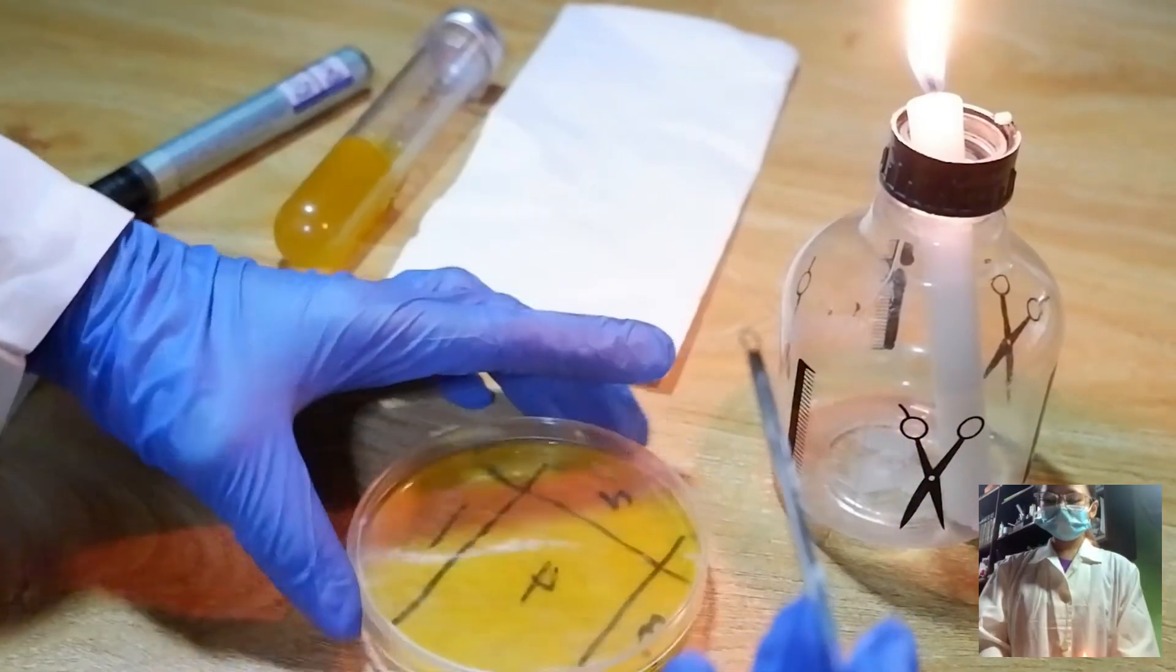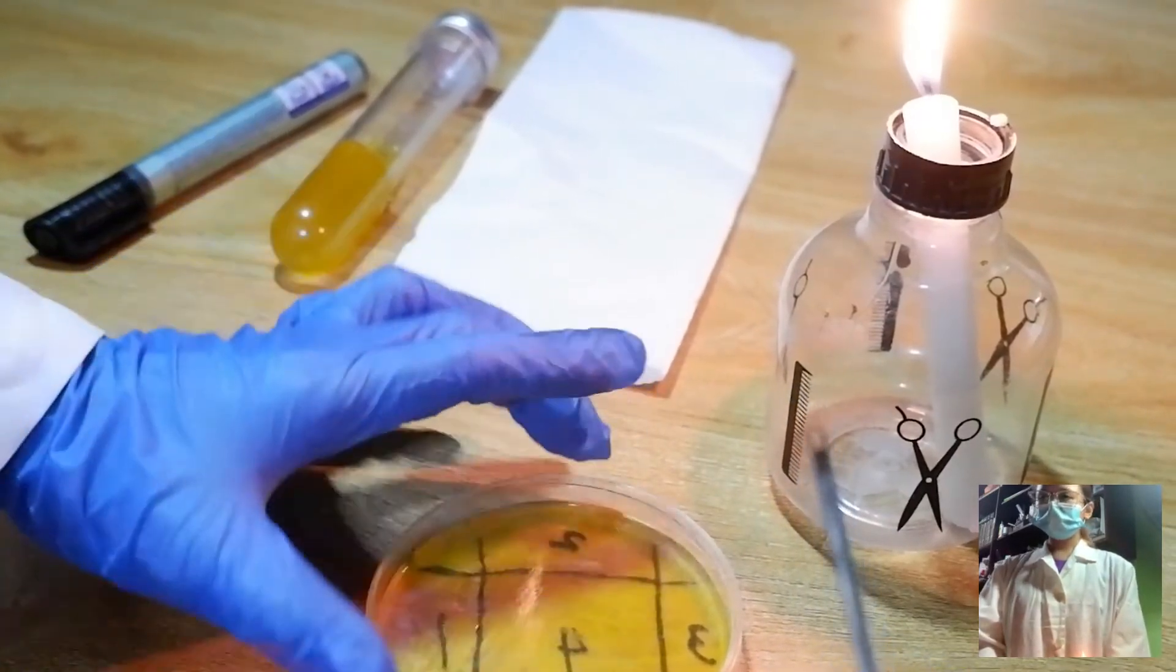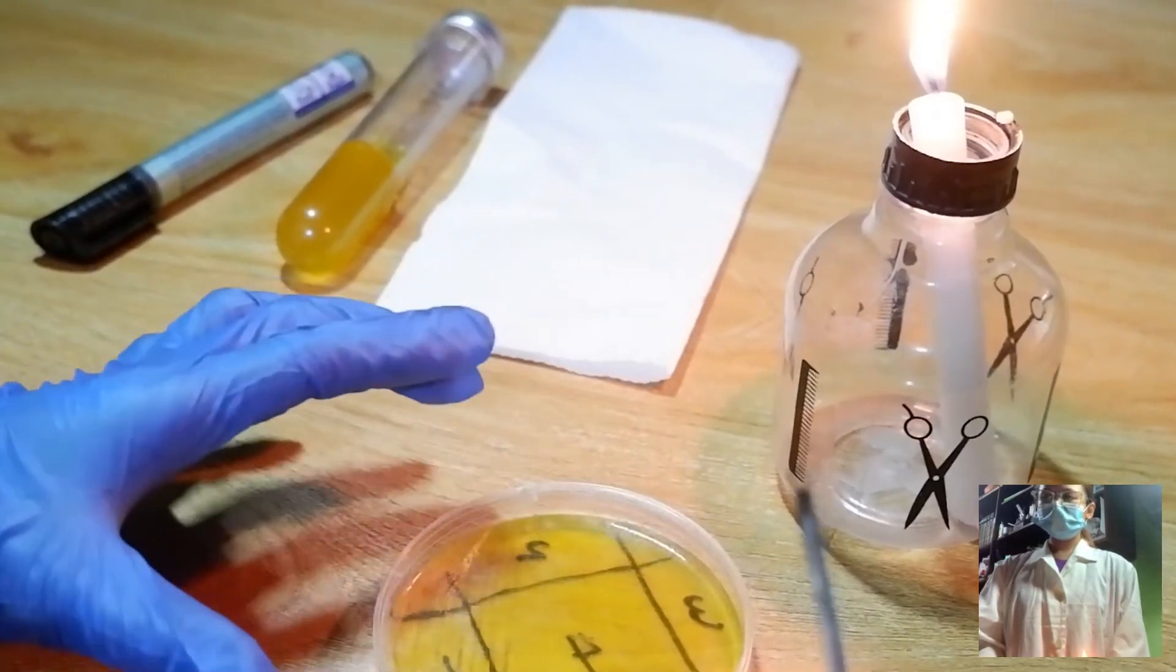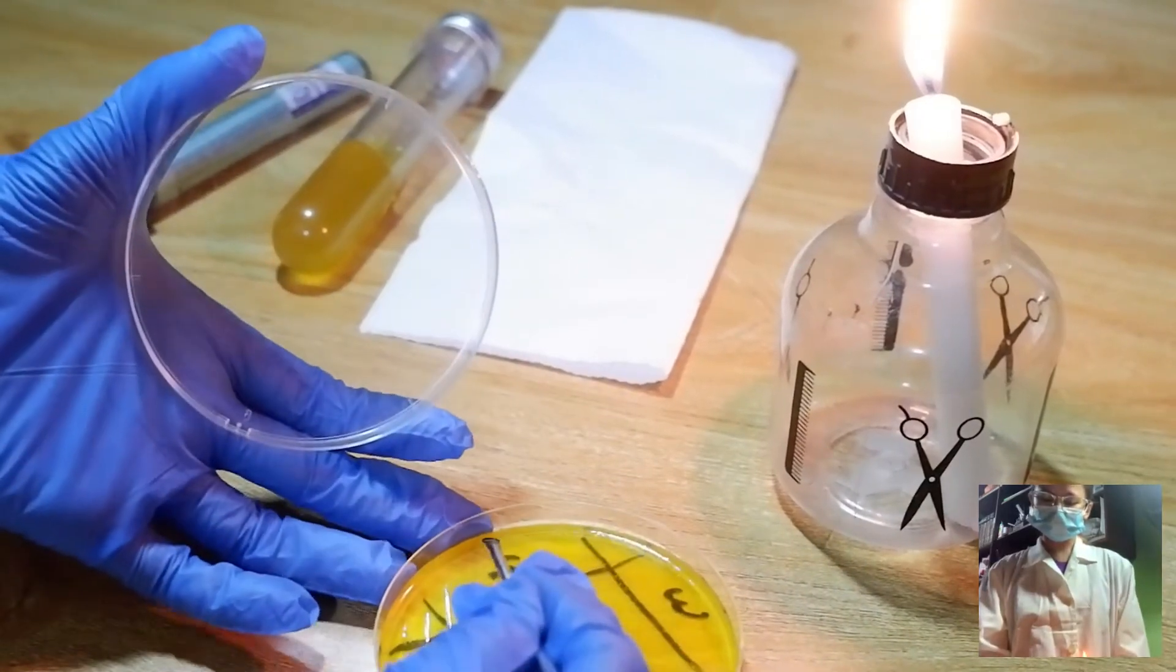Now, we will streak from quadrant 2 to 3. So, rotate it to 90 degrees, and we will streak 6 to 7 from 2.